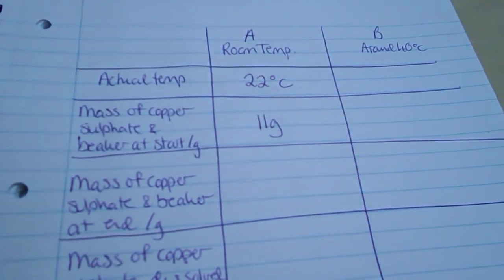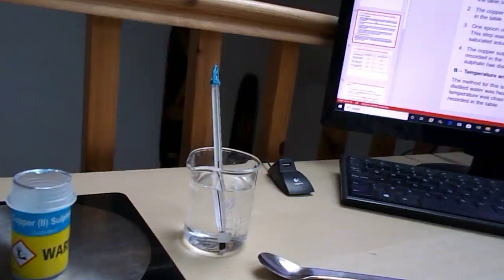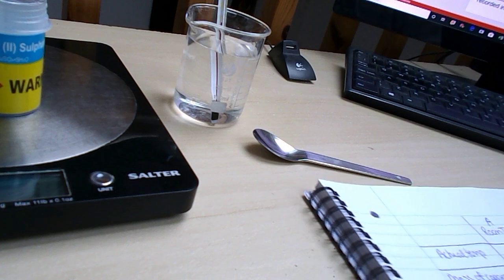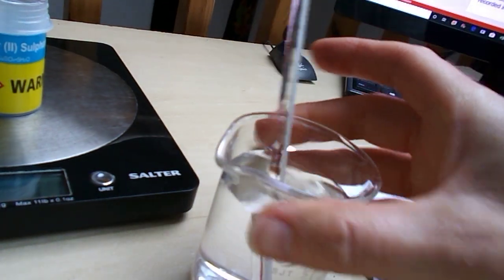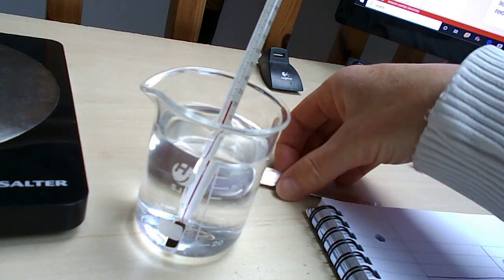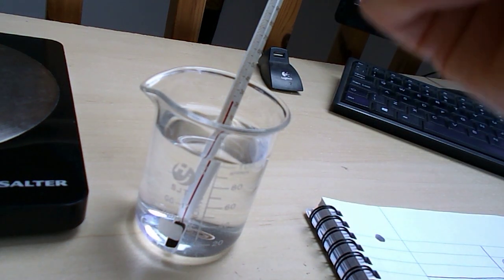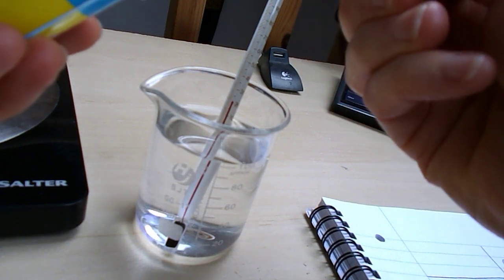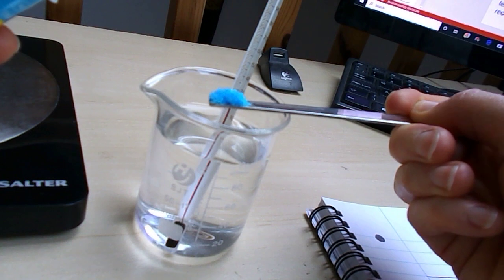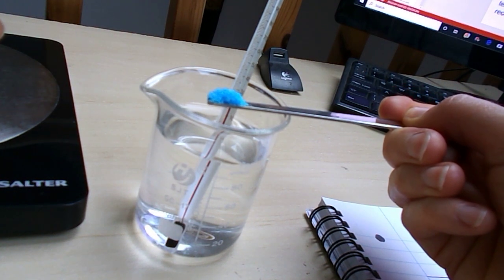Now, what we next need to do is take some of that copper sulphate and dissolve it in the water. So let me just sort my tripod out here so that you can see what's going on. Okay, so I'm going to take a bit of the copper sulphate. I'm going to have to use a backward spoon to shovel some up here. Can we see that that's a nice crystalline blue solid there? So we're going to tip that into the water.